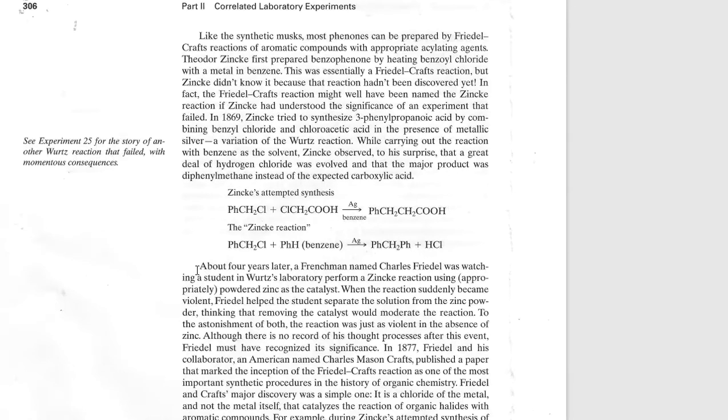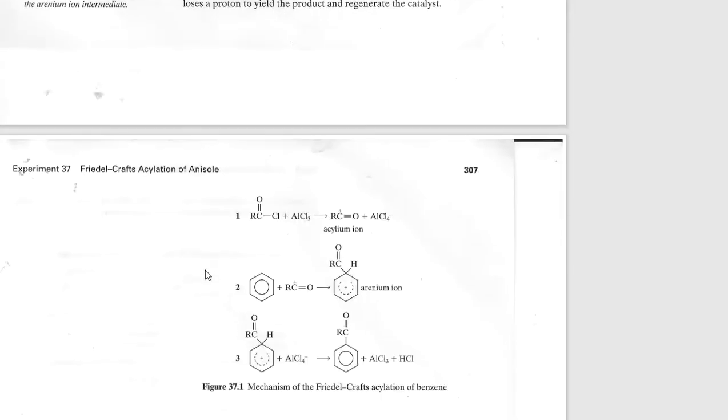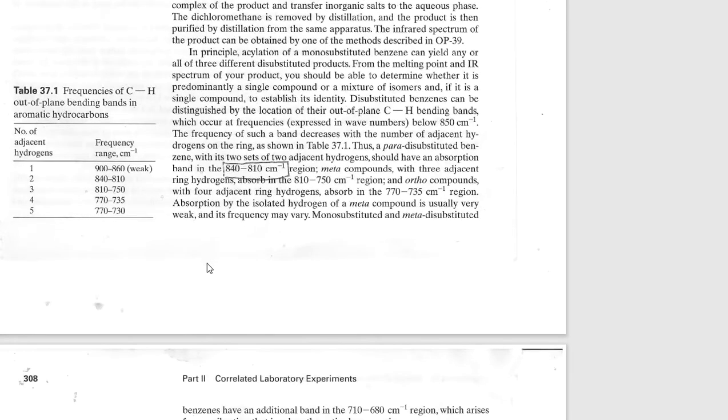So in the laboratory procedure document that you probably don't even read most of the time, you're going to see a very brief table, probably on like the fourth page in. And this table actually states the number of hydrogens. The number of hydrogens will be very important for this particular reaction, because it's going to tell me bands that I will see in the infrared spectrum.